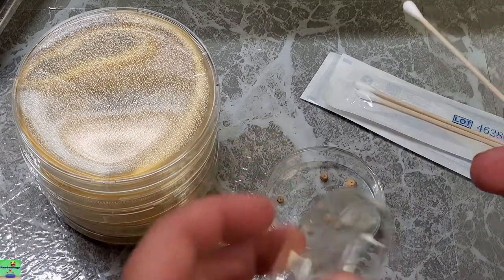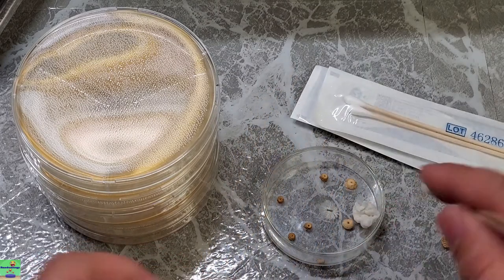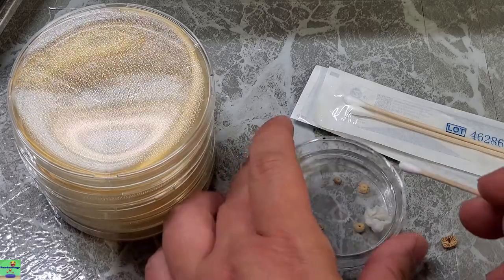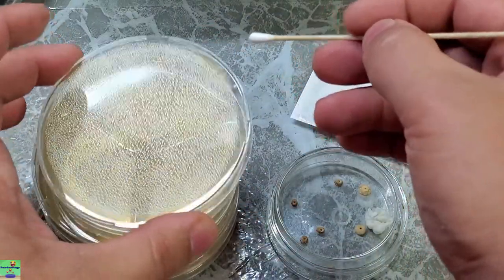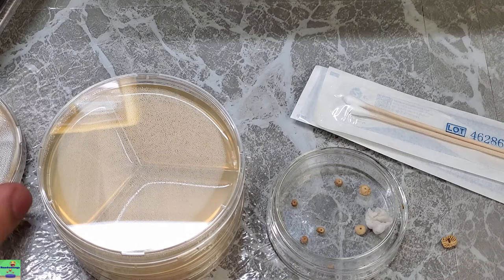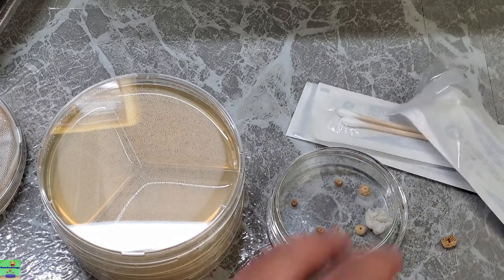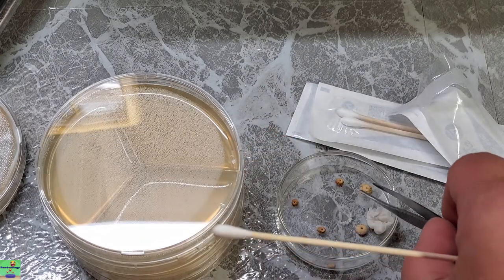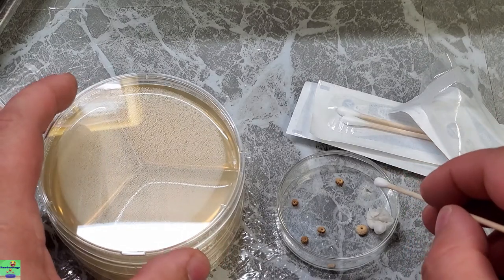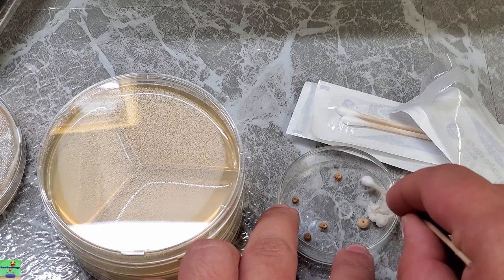Now it's very simple. This is the biggest one, I'm going to just take that out and set it there. Wipe the cotton tip all over your spores, cover that back up, and then very quickly just deposit them onto the surface of the agar. Set that aside. Take the second one, and we'll take some from this right here. You can see that, okay? Yeah. And then do the same thing. I'm probably going to transfer to 5 petri dishes.